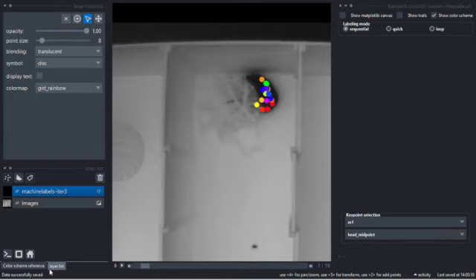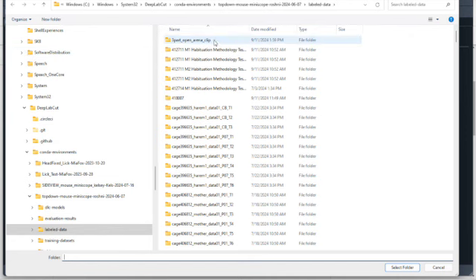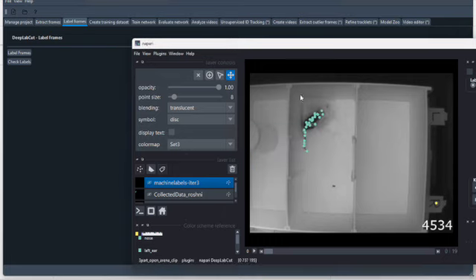Also, let's say this had like 300 frames to relabel, and in one sitting you relabeled like 100, and then you kept this all open and came back the next day and tried to relabel them, and it was acting funky, so you closed out of it and then went back in to label frames.